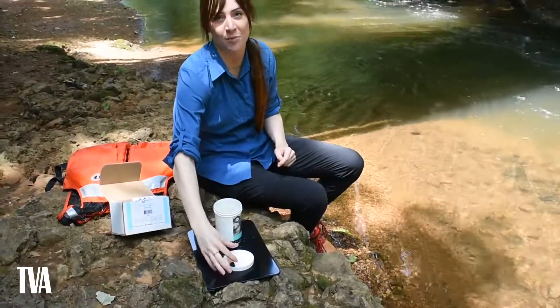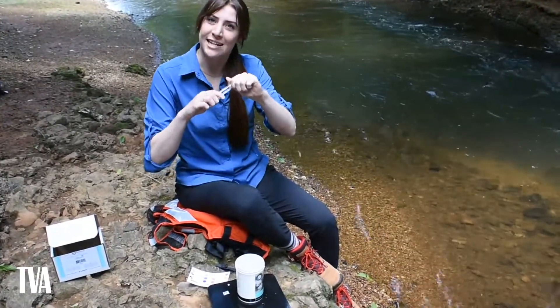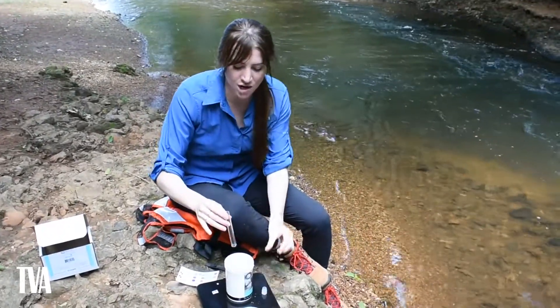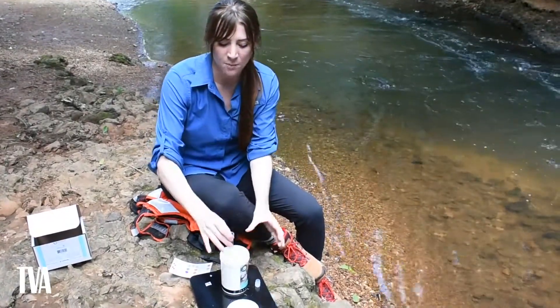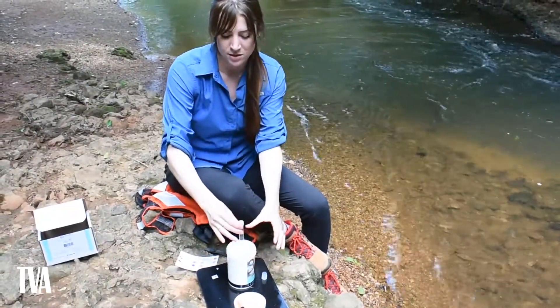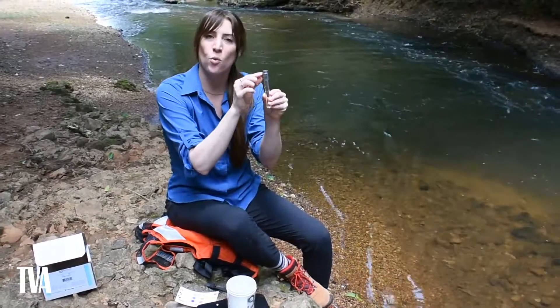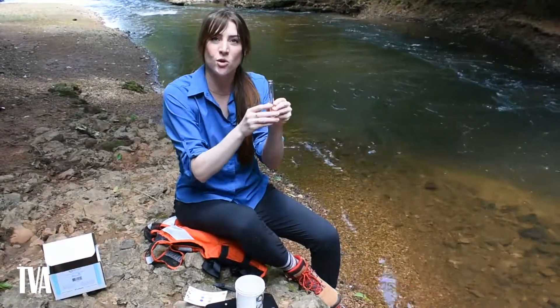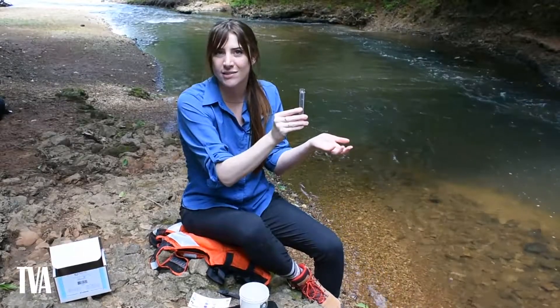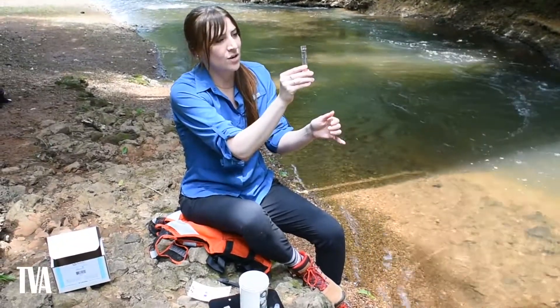Next up is the pH test. Take your test tube and remove the top. Place it in your beaker to fill it — if you don't have enough water, tilt the beaker to the side. Completely fill the test tube. When you pull it out, there is a 10 milliliter line on the outside. You want to get the water back down to the 10 milliliter line by flicking water out a little bit at a time, until you reach the 10 milliliter mark.